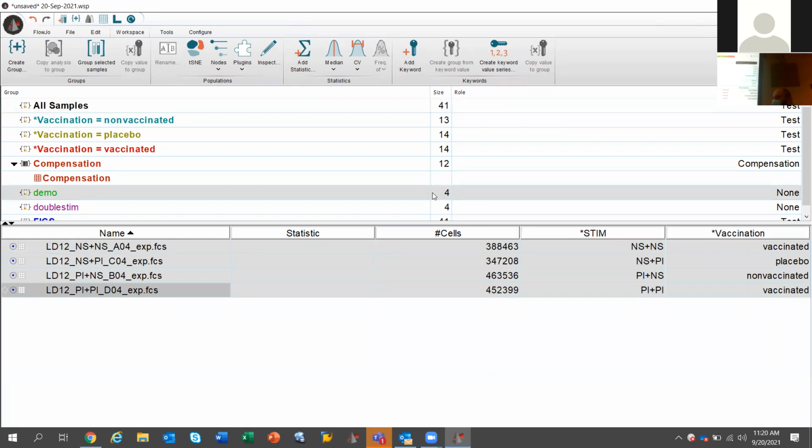So I've shown you on groups how to create groups 3 different ways. One would be from your keywords. Another one would be creating groups, but making it restrictive so it only adds the samples you need. Or 3, how to add samples manually. Okay. All right, now that we covered that, let's move on to the next item of business, because now we cover QC. And we basically cover data organization and management. Now let's go into the actual analysis.